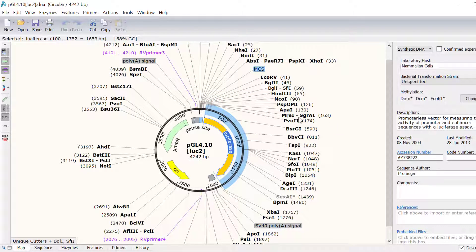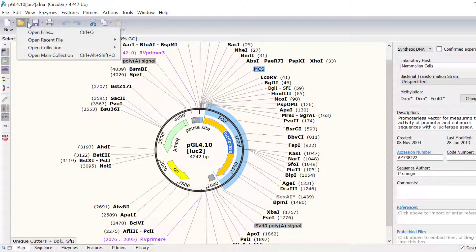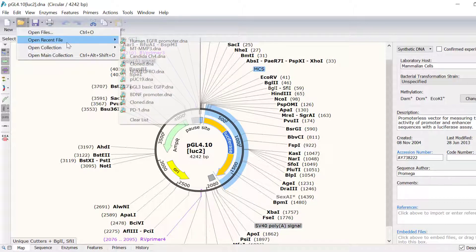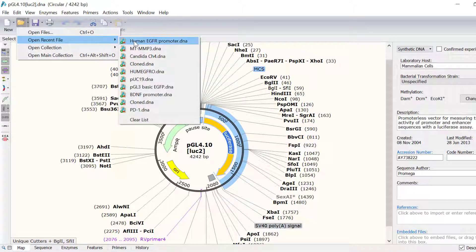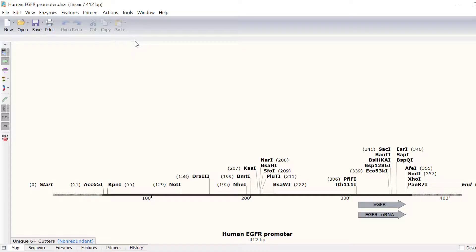I will open up a separate file containing my insert of interest. Specifically, this sequence contains the EGFR gene promoter region. My aim is to insert this promoter region into the multiple cloning site of the PGL4 plasmid.